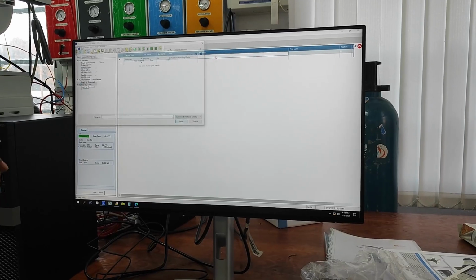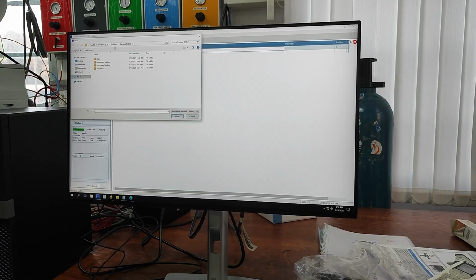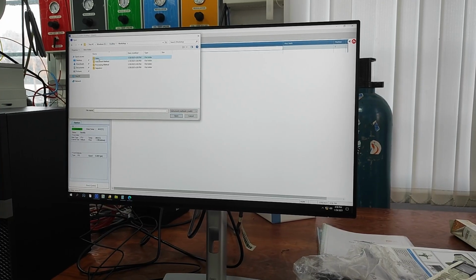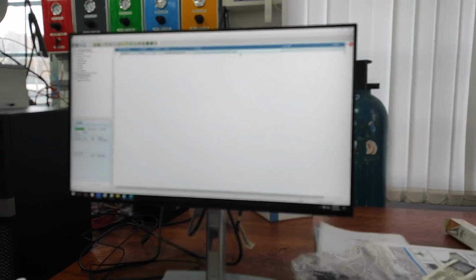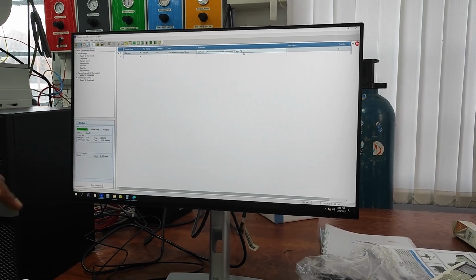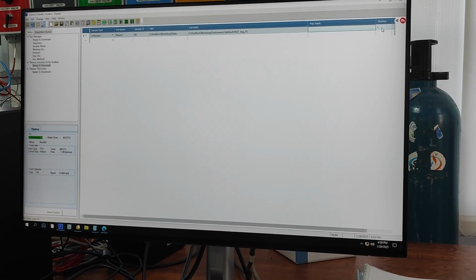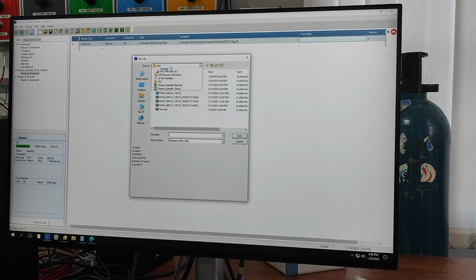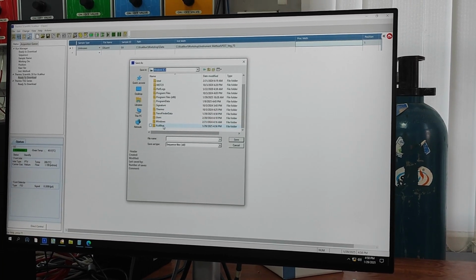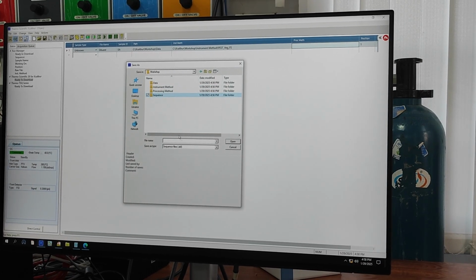Instrument method: now I copy the instrument method, Xcalibur training workshop instrument method. This is the instrument method. So the instrument will acquire the data under all these conditions, whatever we have defined. Processing we will do later, and the rest of the things we will do later. I will just save this as workshop sequence.